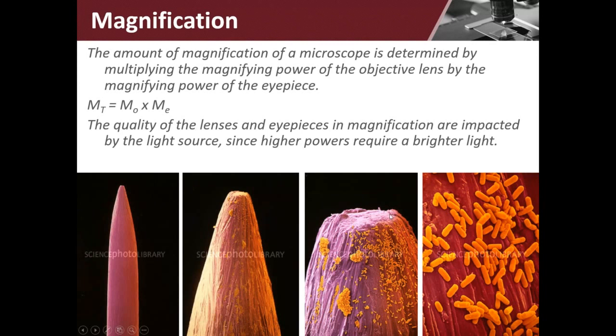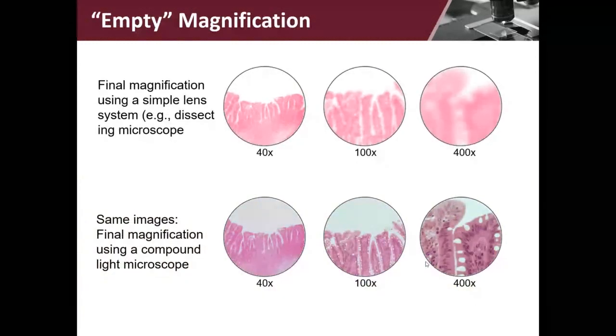Look how not even sharp looking it looks. I mean, a pin pokes us, but at the actual tip, there's still a flat surface, and you can see these little orange things. And if you zoom in even further, you can see there's a little bacteria. This is why you have to be careful. For example, if you get poked with something really deep in your skin, it could be bringing bacteria into the deep depths of your skin, which could cause an infection. That's why you have to clean a wound.